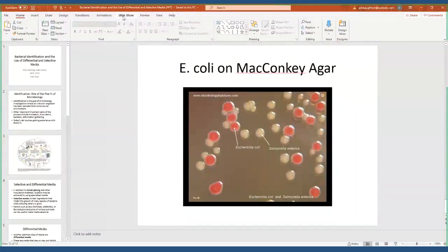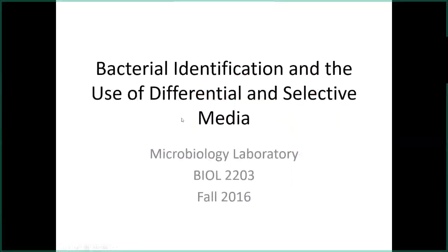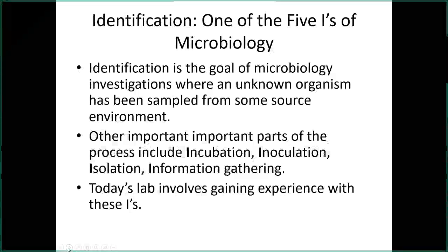So this one is on bacterial identification and the use of differential and selective media. Let me go ahead and pull it up. We'll start this slideshow. All right, so you can see it goes back a little ways, but the information hasn't changed, so we still use this.